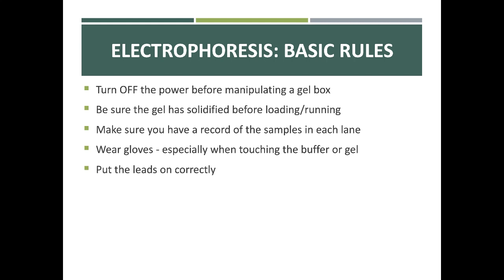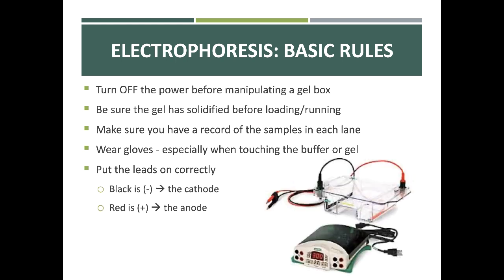Put the leads in correctly. Everybody's done this once or twice. I promise you the leads are put on the wrong way. When I say leads, I mean the cables, mixing up the positive and negative cables. As I said, by convention, the black cable is the negative charge and the red cable is the positive charge.